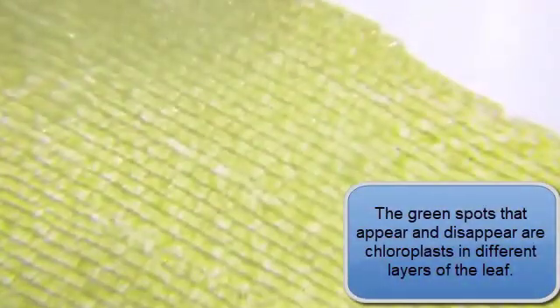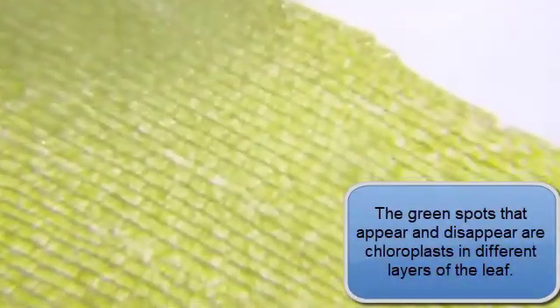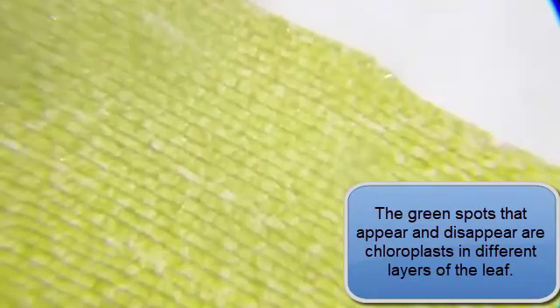So, as I focus up and down a little bit, different areas of the, you can see spots in different areas of the cell. And that's because the cells aren't flat, they're three-dimensional. So, as I am focusing up and down, you're actually seeing chloroplasts in different layers of the plant itself.